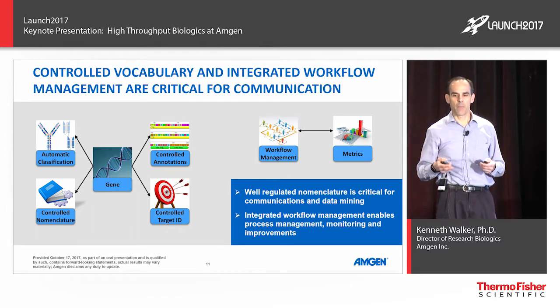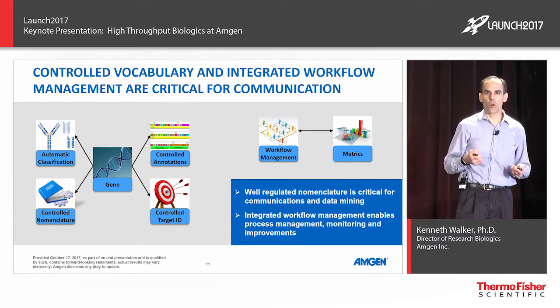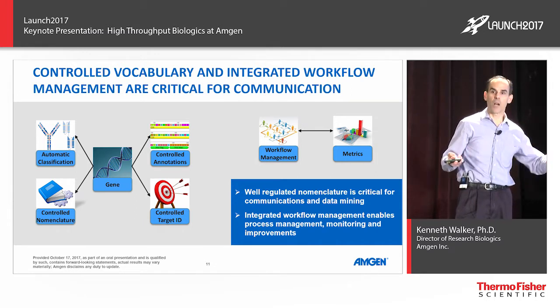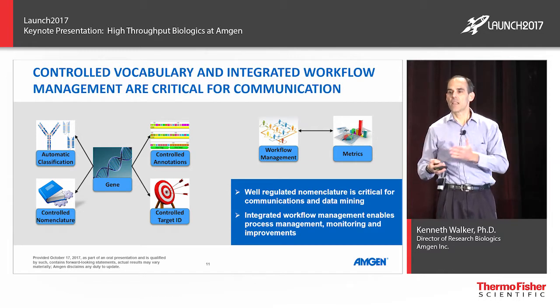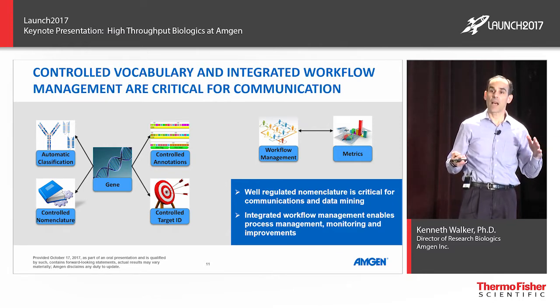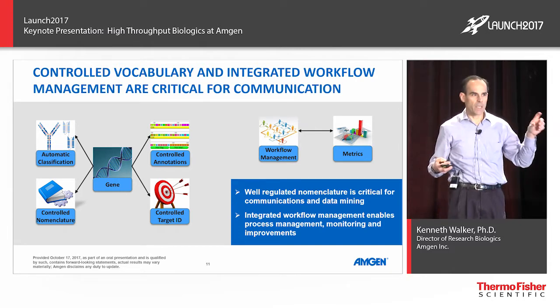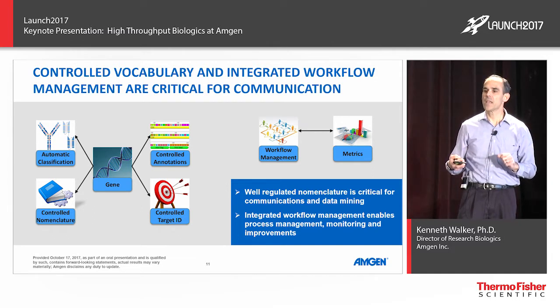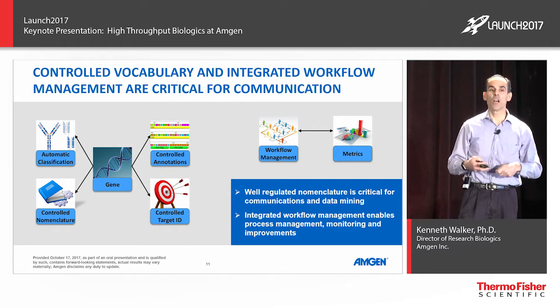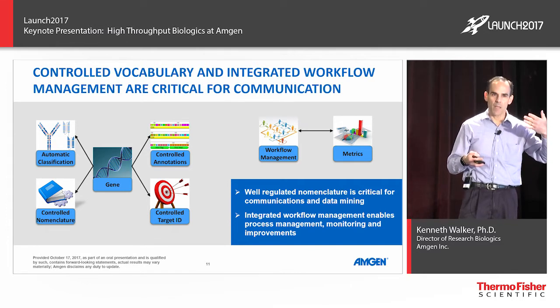One part of the LIMS system that might have been a little bit less obvious, and maybe early on it wasn't completely obvious how we were going to do this, but we wanted to incorporate some type of workflow management. And it really is kind of a natural marriage because your LIMS system to a large degree really is monitoring your workflow because it's following your molecules from the very beginning to the very end. It knows what's happening to them and when it's happening. So what we did was we actually also built the other end, the high end. So we built the top layer, which is basically where you set up the request and you define what types of experiments you want to happen in the request in the very beginning. And so that's your initial part of starting your molecule sets moving through the system. You create a request that kind of sets up the beginning of the workflow.